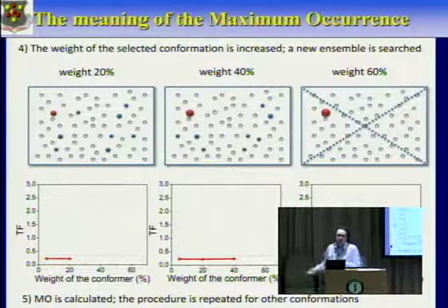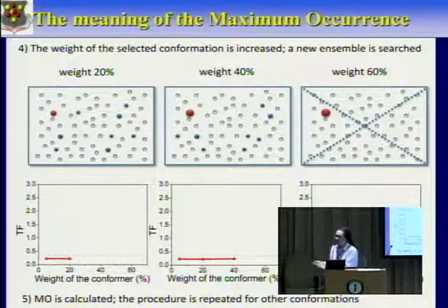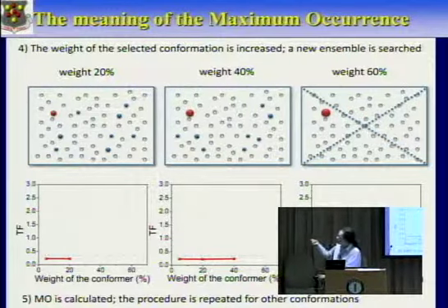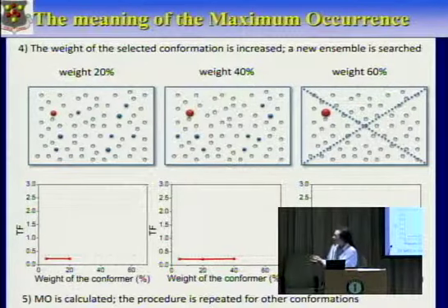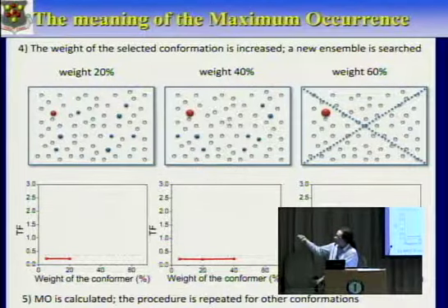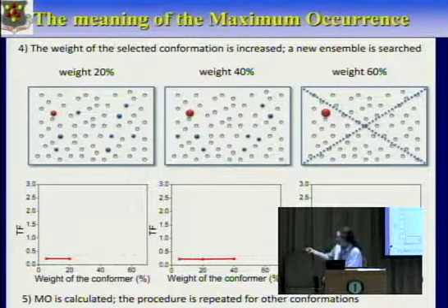And again, the fixed threshold, of course, has some degree of being arbitrary, and that's probably the most difficult part of the job. So this is what happens with one structure around which we will build an ensemble. And as I said, we actually generate several hundreds of these, or let's say a few hundreds of these, 300-400, meaning that we just pick another structure at random and we redo the same trick and again until 300 or 400 structures, and we build all of these curves.